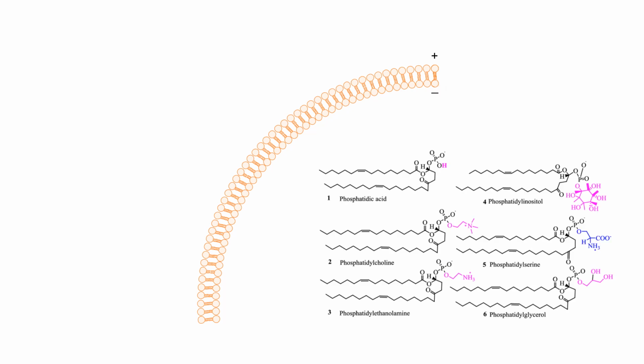Now, if you want to get live cell imaging, we need to think about the live cell's properties. In live cells, the most important thing is metabolism and also material exchange. Live cell membranes have a membrane potential. Usually we consider the outside of the cell positively charged and the inside of the cell negatively charged. But if you look at the chemical structure of phospholipids, many phospholipids are negatively charged. Some of them are neutral molecules, but actually there is no positively charged phospholipid.